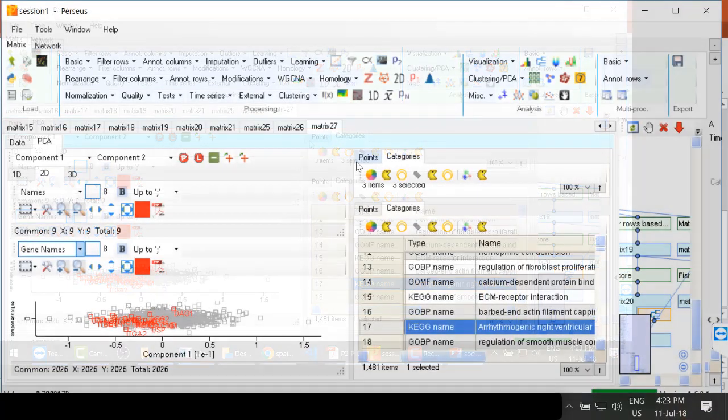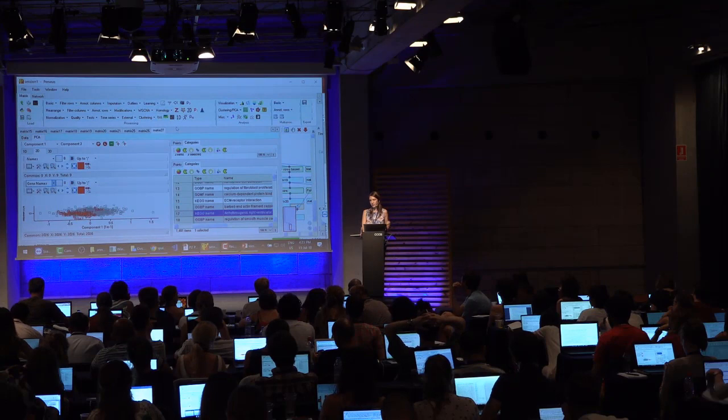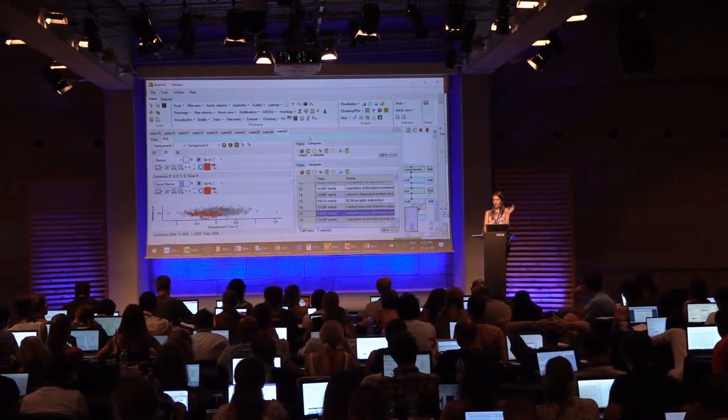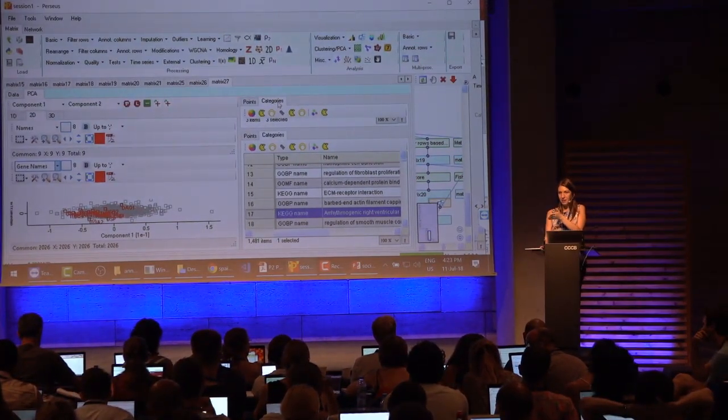So why I asked is because in many cases, you may expect that you would have batch effects, and then it's really important that you do your experimental design in order to account for this already. So, okay, in this case, maybe you can't if you're constrained by, I don't know, your collaborators. That's why you do it in different time points. But normally, the best way to account for the batch effect is already at the experimental design level.